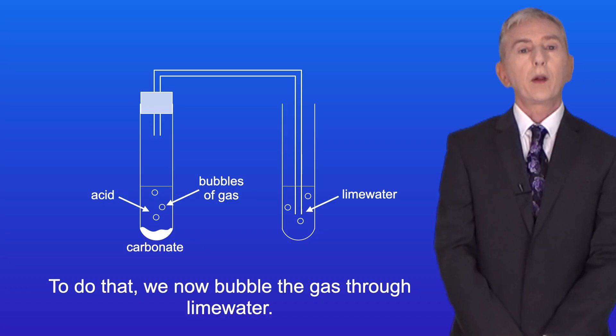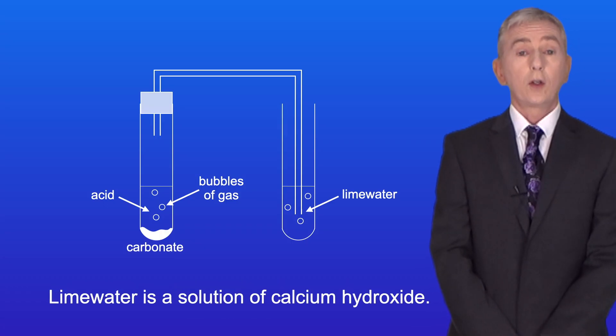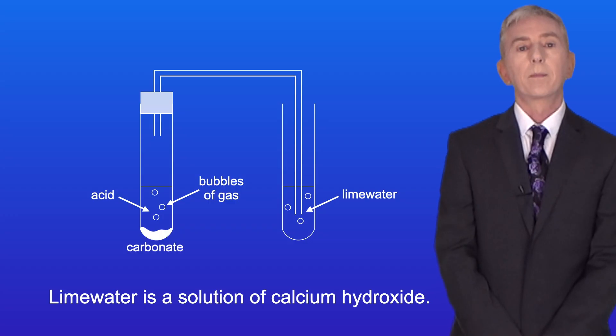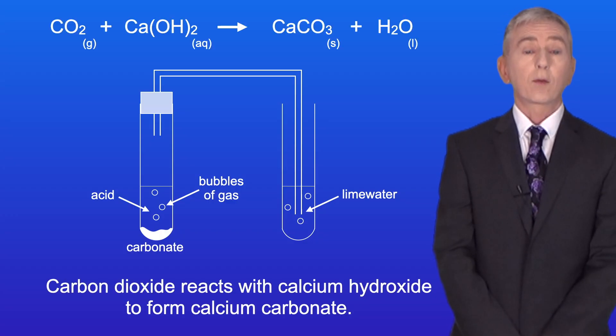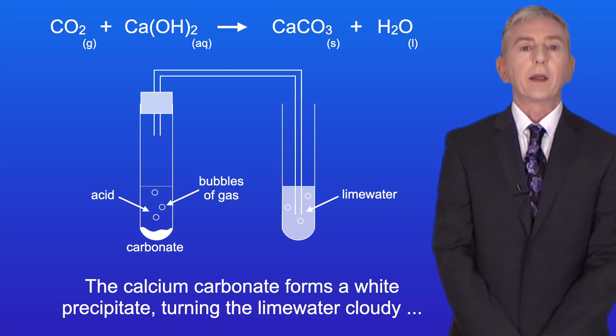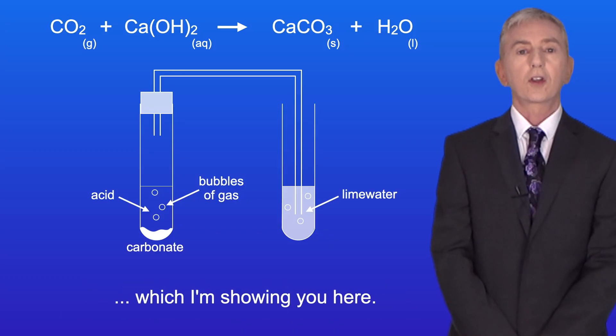To do that we now bubble the gas through lime water. Lime water is a solution of calcium hydroxide. Carbon dioxide reacts with calcium hydroxide to form calcium carbonate. And the calcium carbonate forms a white precipitate, turning the lime water cloudy, which I'm showing you here.